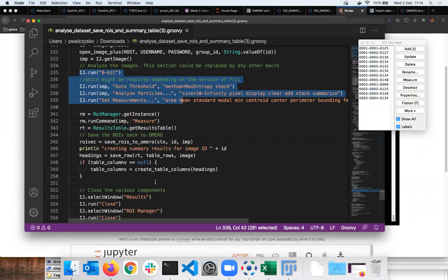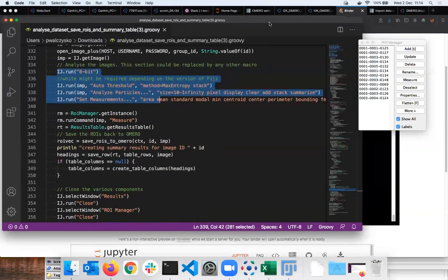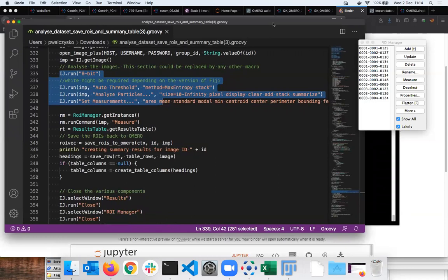Each language has its own, there is no common ROI language. We're trying to work on that, but we do the same with other software, like Peter can show with QuPath or other third-party tools. They need to be converted into the original form and put into OMERO. Just stay on that page, and then we move and associate it. Then after that, we upload the results.